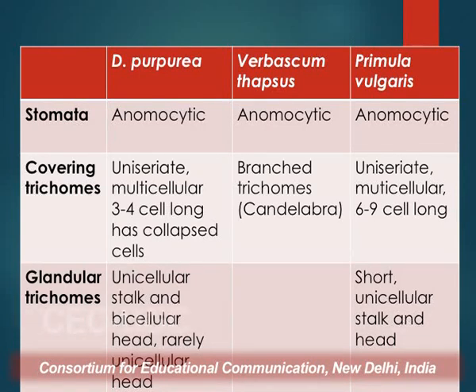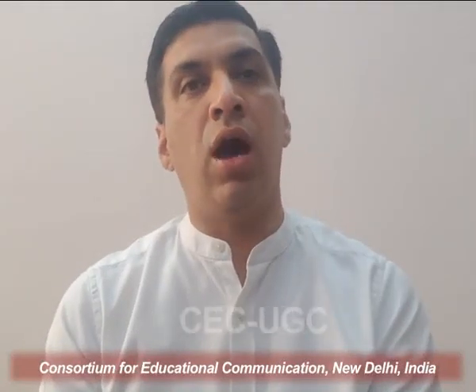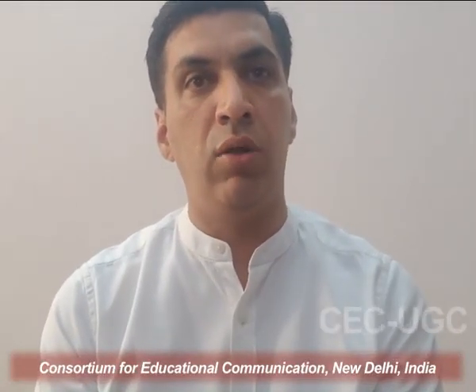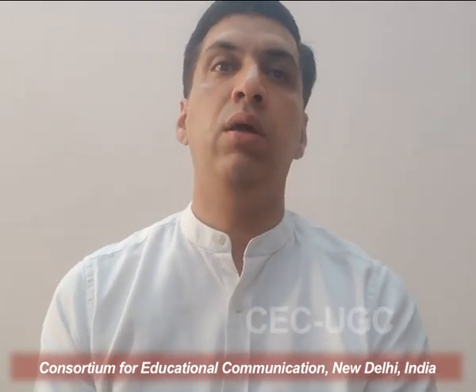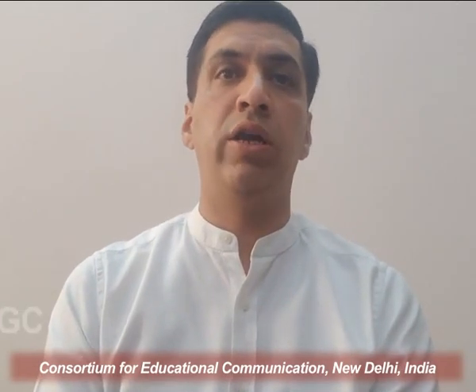So if we are observing a large amount of glandular trichome with unicellular head in case of Digitalis, then we can say that Digitalis purpurea leaves may be adulterated with Primula vulgaris. So this is how these qualitative microscopic characters help in differentiating.